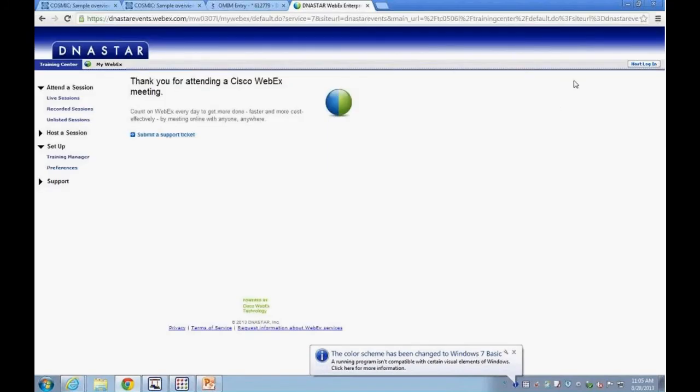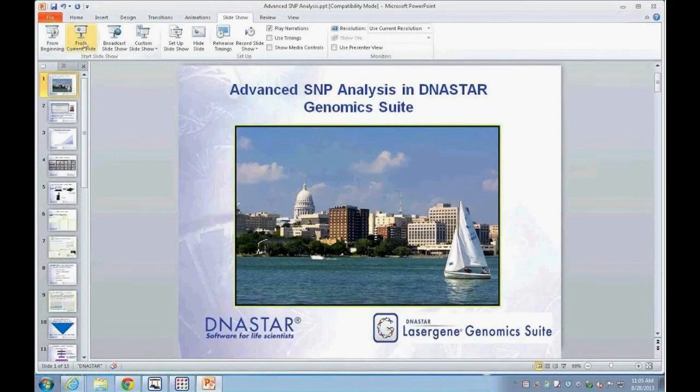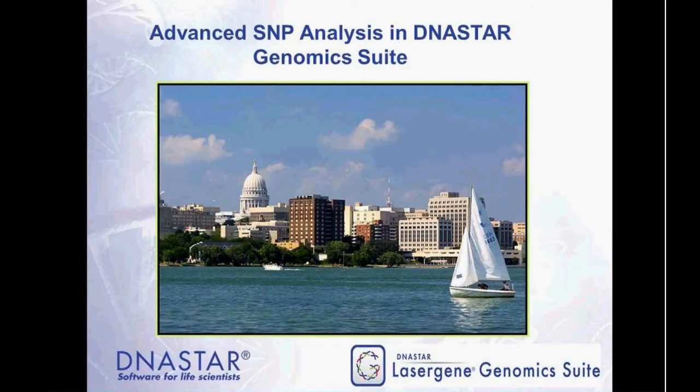Thank you, Jackie. In a minute I'll be sharing my desktop so we can start out with a little bit of a PowerPoint. Today we're going to be talking about some advanced SNP analysis in the Genomics Suite. We've covered some similar topics in the past.